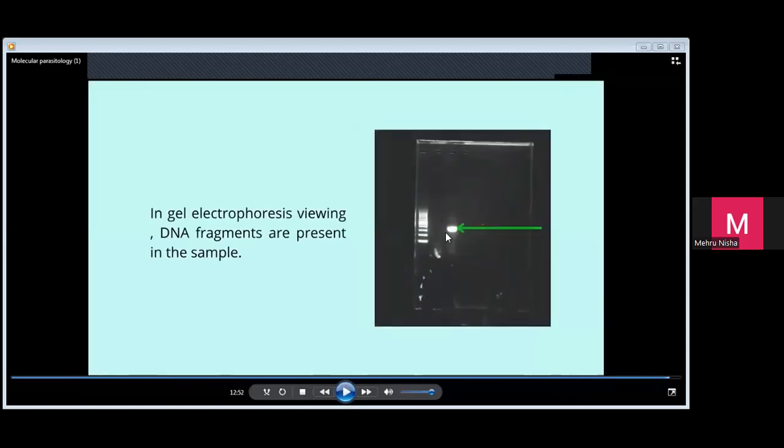Okay, so good. We managed to get Ascaris amplicon here. So you see this is 100 base pair. This is like a ruler, 100, 200, 300 and so on. And we got, so we can say our PCR is a success. There will be many times that you don't get anything. So it could be something went wrong. Your DNA not enough, PCR enzyme expired and so on.